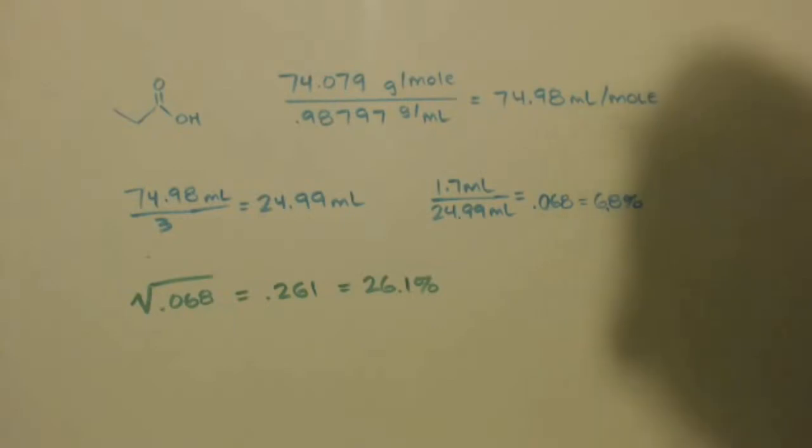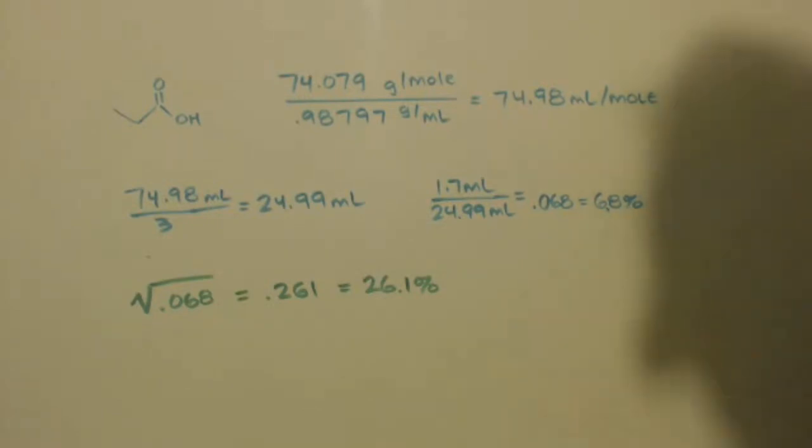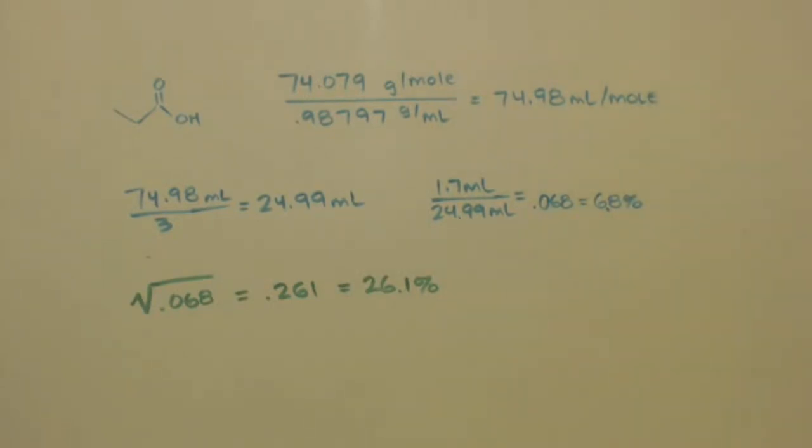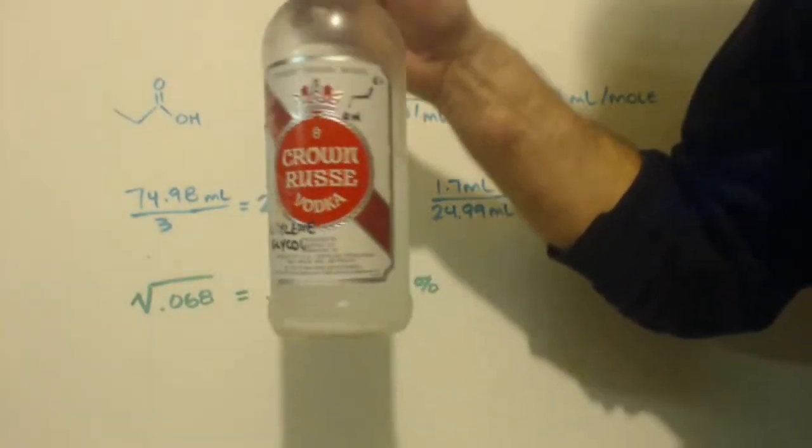I only put half as much as I planned, I think. I'm hoping, because that would be good, that I could easily fix that, you know what I mean? Just put the correct amount and double it next time I do this reaction. Now, I got a lot of diethyl ether. That's about 500 milliliters of diethyl ether right there.